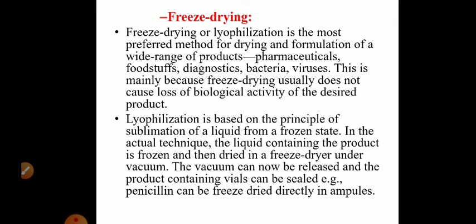Under vacuum, there is no rise in temperature at all. The vacuum present can be released, and the vials are sealed. For example, the antibiotic penicillin is freeze dried directly in the ampules in which it is taken.